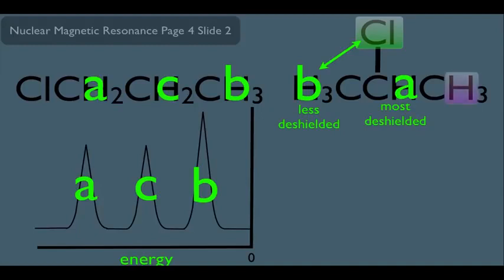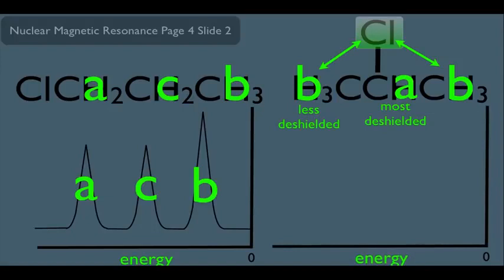But what about these hydrogens over here? Notice they are an equal distance to the Cl as the B-type hydrogens. So that means these hydrogens are roughly in the same electronic environment. The amount of energy to bring them into resonance would be the same, which means we can also call them therefore B-type hydrogens. They are literally equivalent. So what does that mean here? Again, what would the NMR spit out as its data? Since there are technically two types of hydrogens in this molecule, A and B, we should expect to only see two signals in its HNMR spectra.